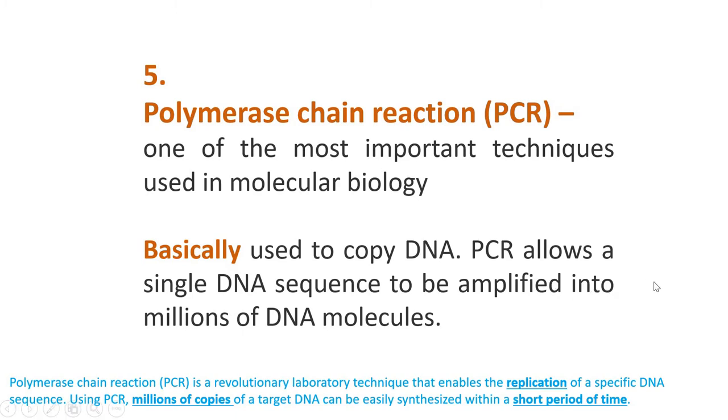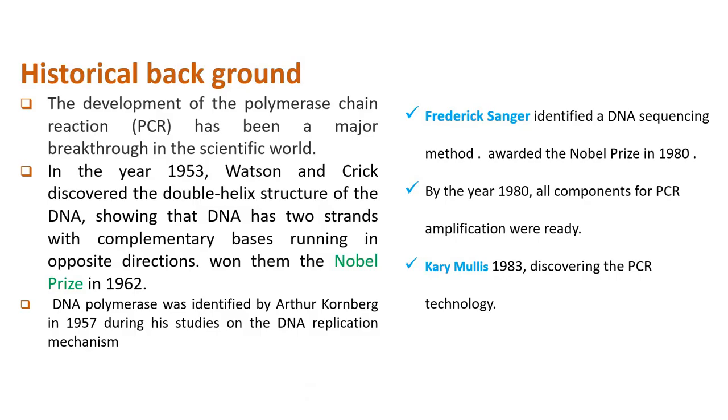This PCR technique حقيقة هي revolutionary lab technique صارت عندنا بالقرن الماضي that enables the replication of a specific segment of DNA or sequence of DNA وممكن نطلع من عندها millions of copies of that specific target or sequence of DNA in a specific short time. ناخذ الفكرة عن history of development or discovery of this PCR technique.